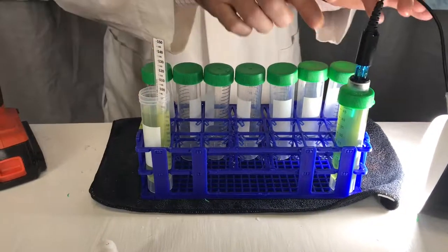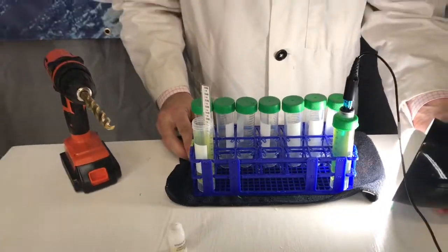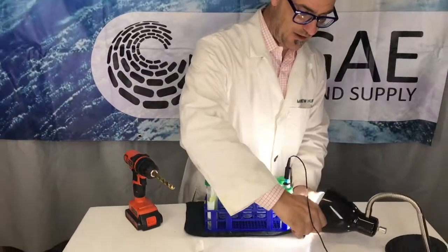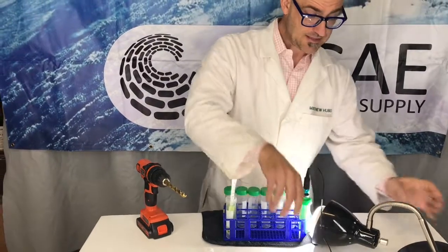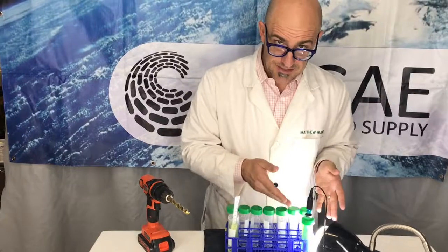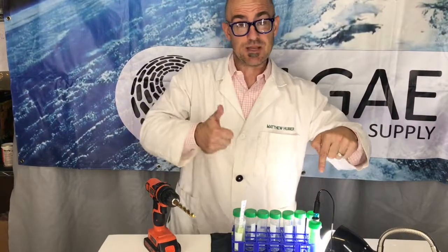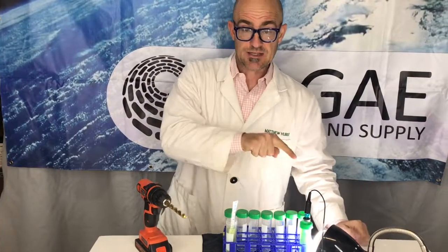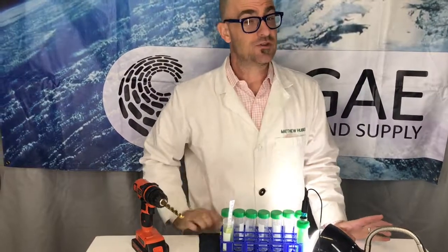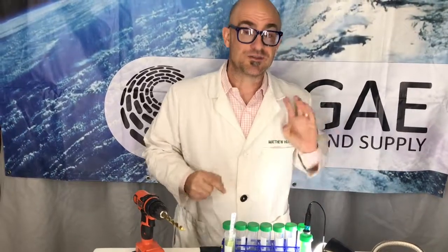Now start tracking the pH change on your computer — you're going to be looking for a slope, and this is almost exactly like a P versus I curve. You've got a lot of photosynthesis taking place, so your pH is going to be going up, giving you a slight change. This is much more dramatic if you're measuring oxygen, but if you don't have an oxygen probe, the pH probe works just fine.